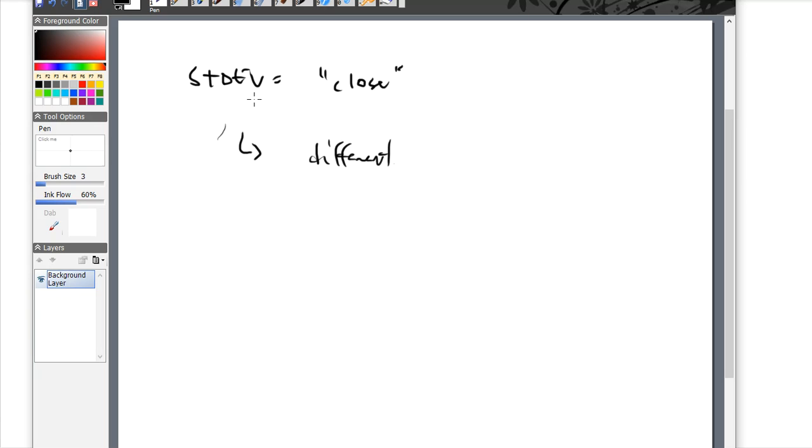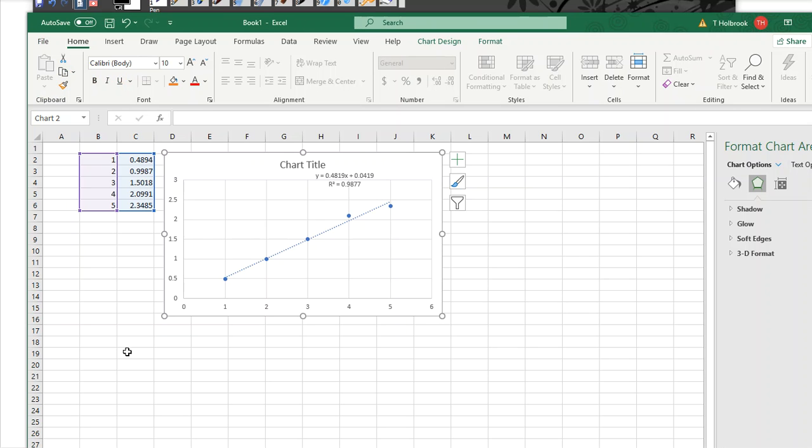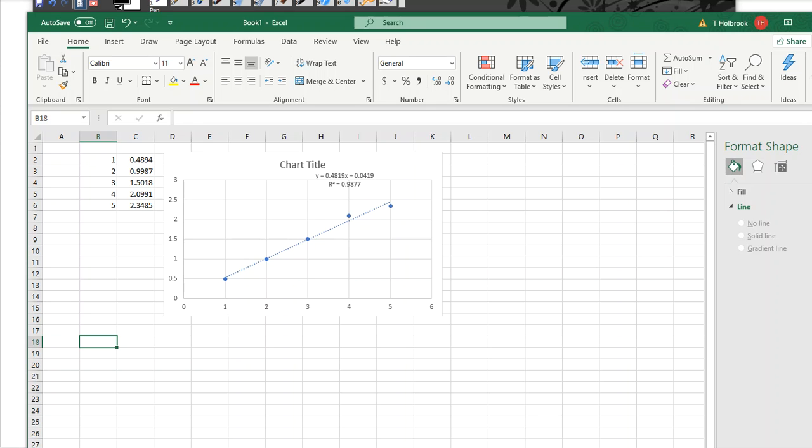So standard deviation in Excel is this code. Do not calculate this by hand. That's a waste of time. Why would you do it? You've got technology at your fingertips. So use Excel for its purpose and allow it to calculate the standard deviation for you.